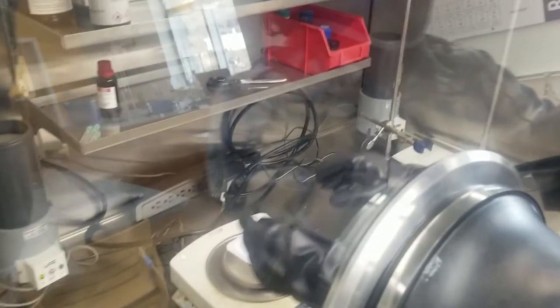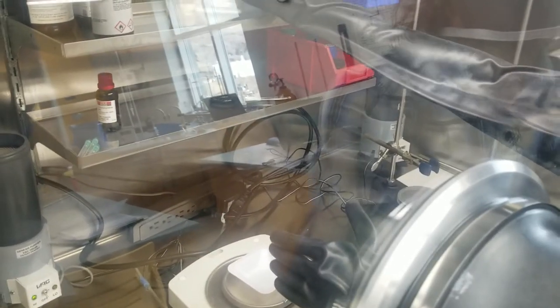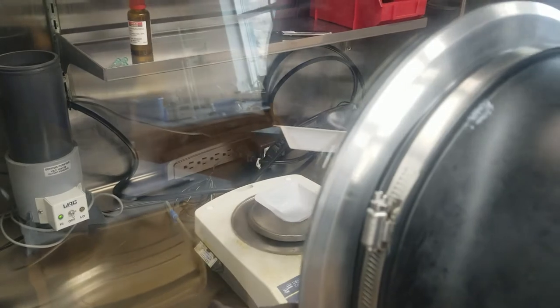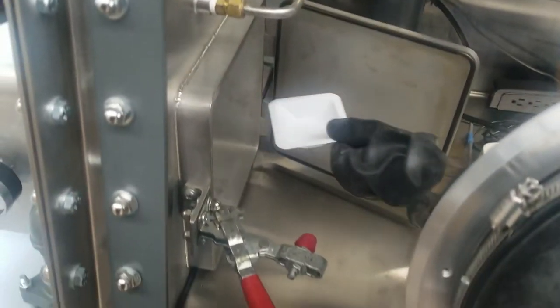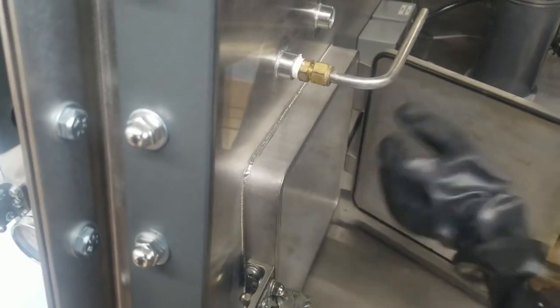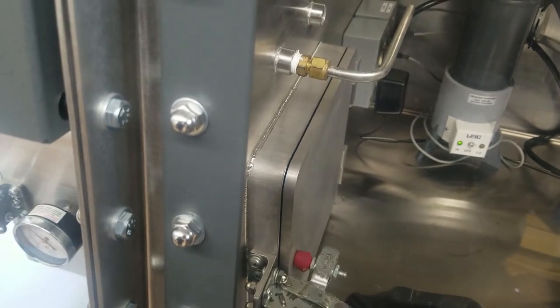Okay, now we are going to show you how to take something out of the glove box. We are going to take out this weigh boat that we actually just put in. So all you're going to do is you're going to open up this door here, just like we did to put it in. And we're going to put the weigh boat into the antechamber.